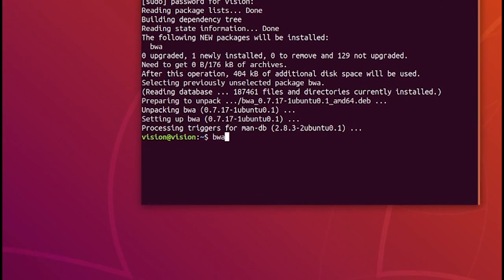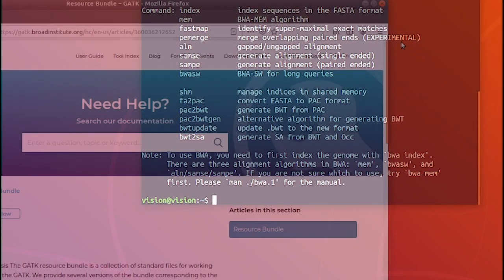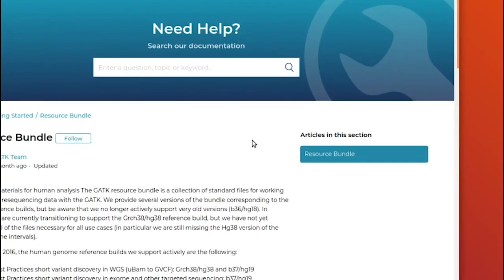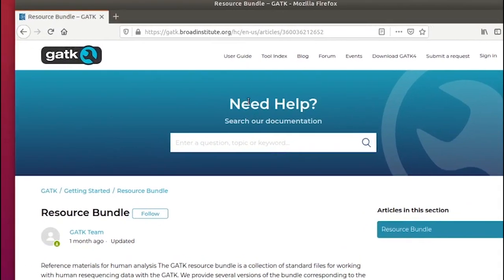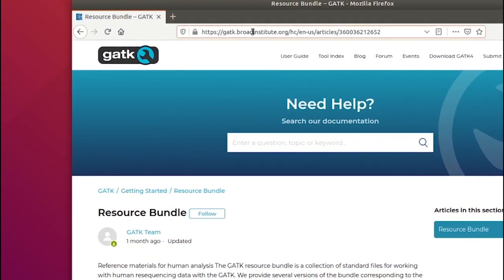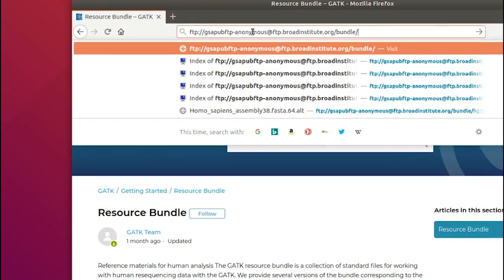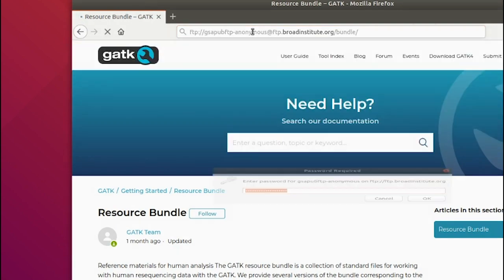Next, you will need a reference genome in order to get your career in bioinformatics going. Among other places, you can collect the human reference genome in different versions as part of the GATK resource bundle provided by the Broad Institute.